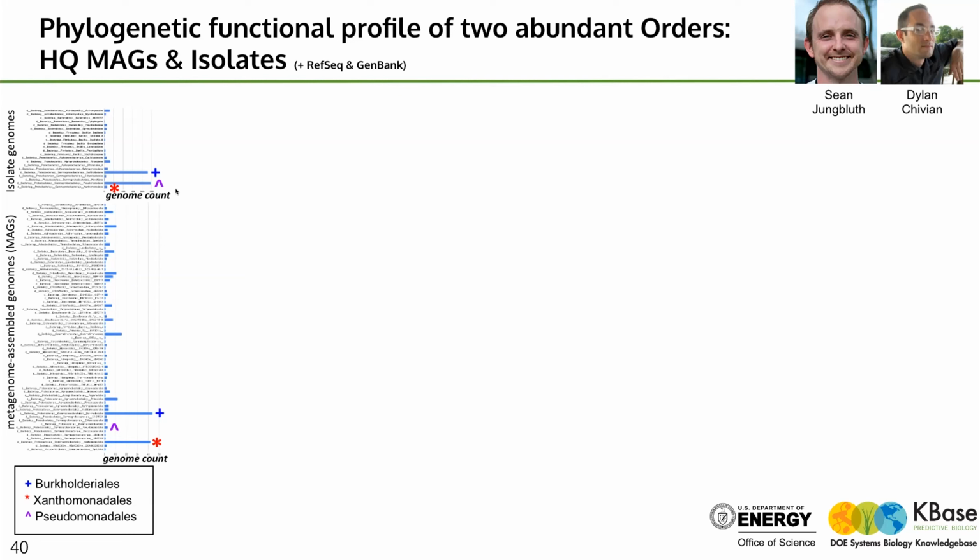Now, during the same time we're collecting that sediment, we were actually enriching microbes from that sediment and other sediment. And we found a lot of pseudomonads, some Rhodanobacters, and a lot of Burkholderia from the cultivations. So the cultivations are a bit biased. They like weedy, fast-growing organisms. Rhodanobacter's not so bad at that, but we've only got a few Rhodanobacters out of that. But now we want to see if any of these map to the critical MAGs that were sitting out in the field.